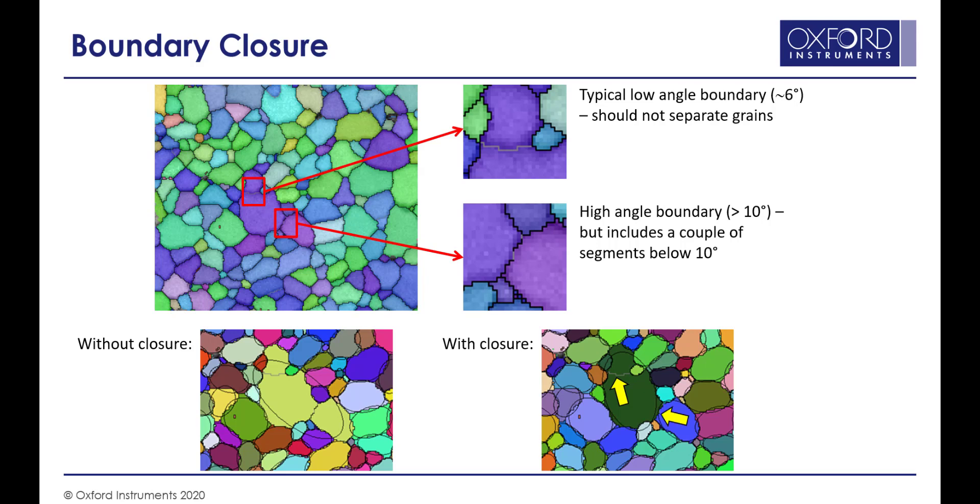But for the lower right grain, it closes the boundary off and separates the two grains. So they're measured as separate grains, as we would if we were looking at them by eye.